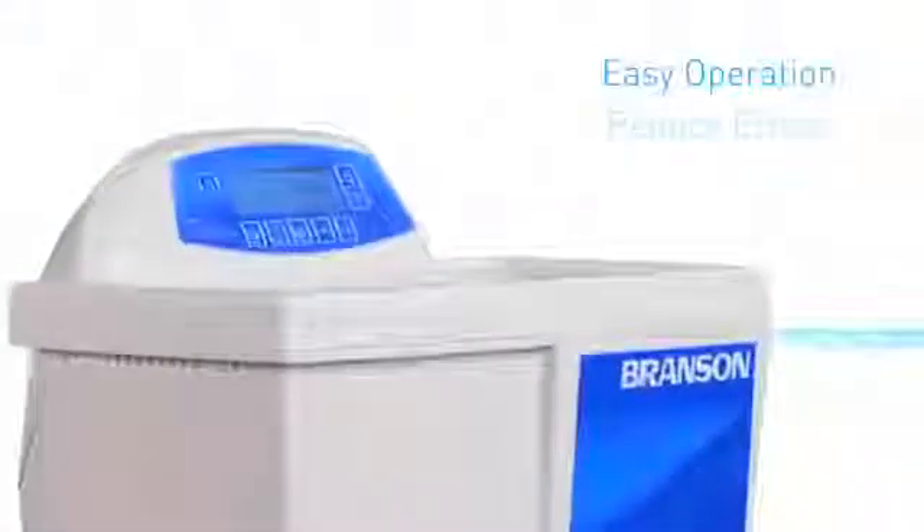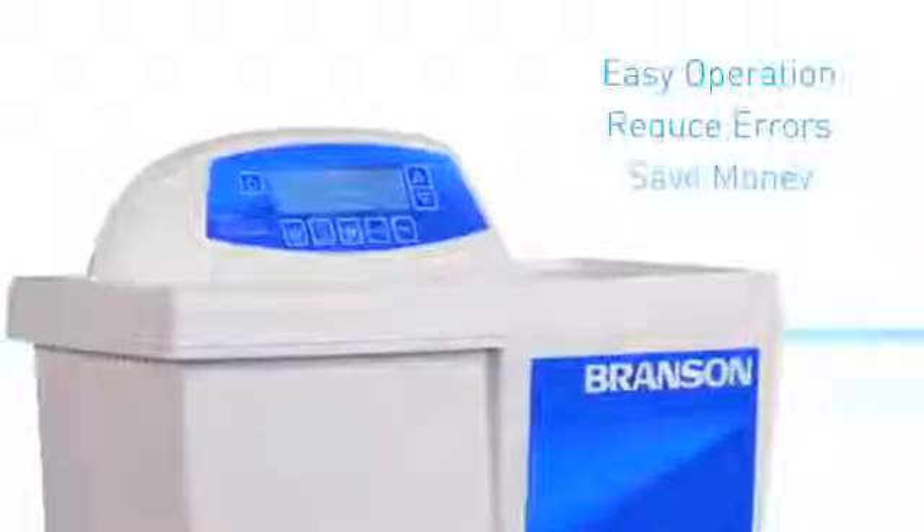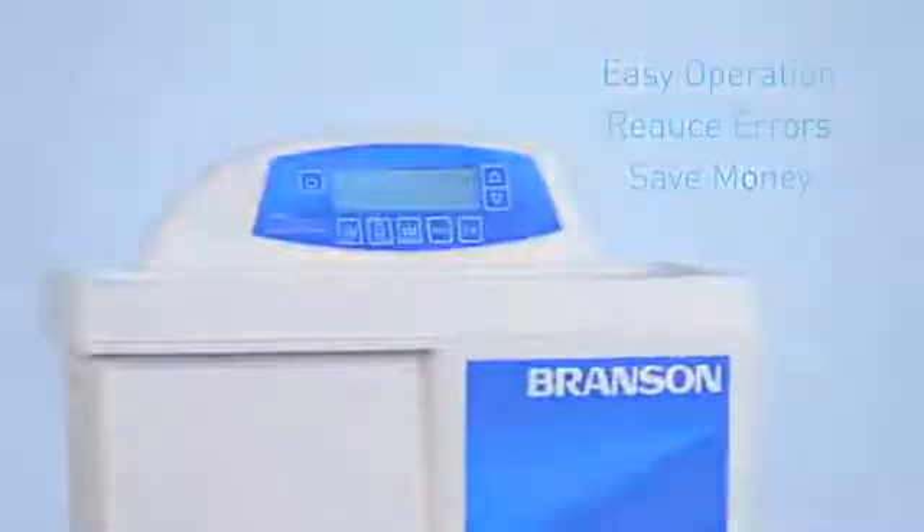All you have to do is adjust the time and temperature, if needed. It's hassle-free operation with the lowest margin of error to help you save time, money, and peace of mind.